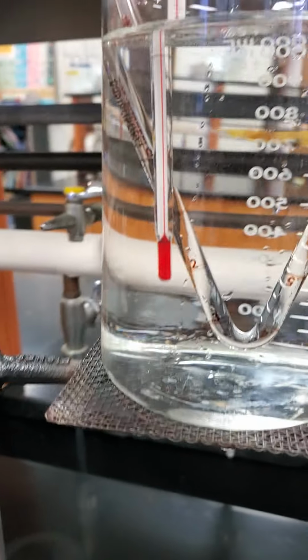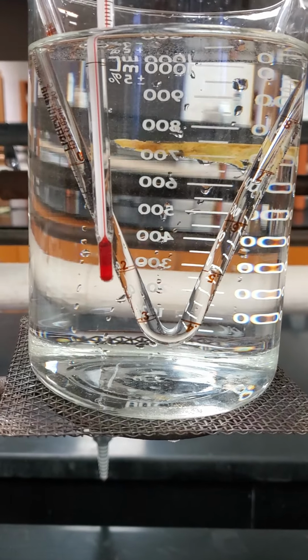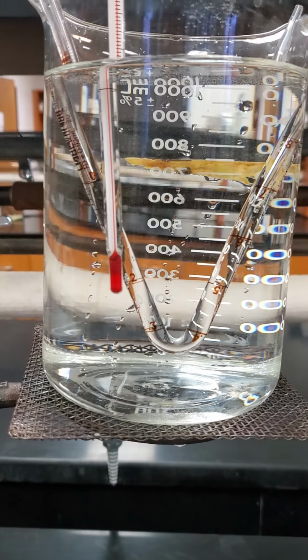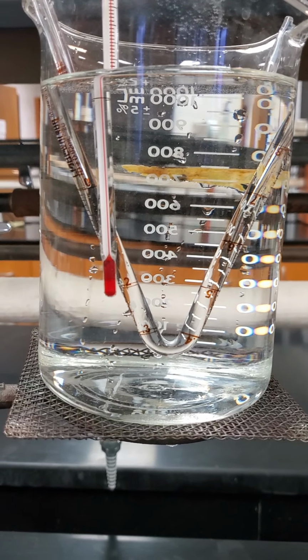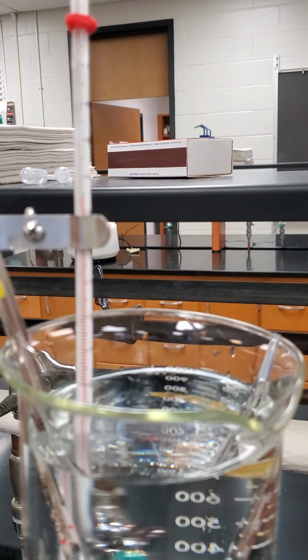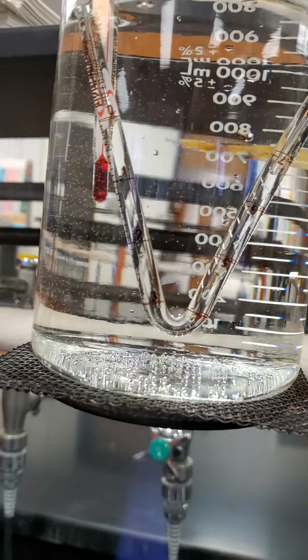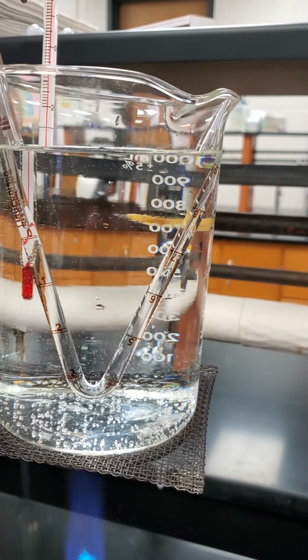Okay. I'm going to start the flame and then record every 10 degrees, I mean every 10 degrees, and then I will stop. I will start the video again when it's time to record it. So I'm going to do the first reading, and it says 34.5 degrees, and the bubble is at 0.660. Okay, I'll do the next one at about 45.